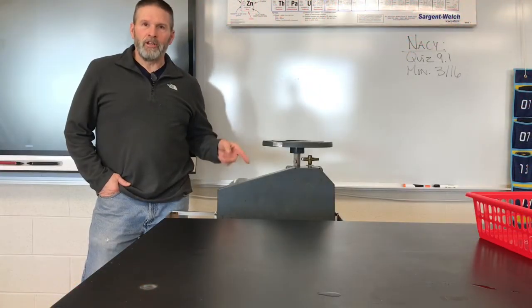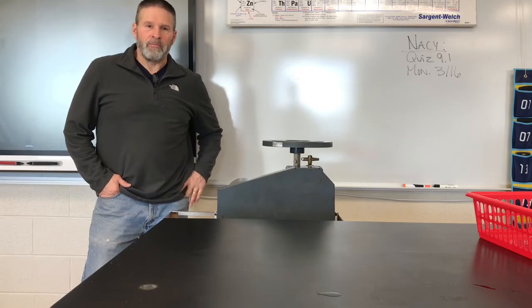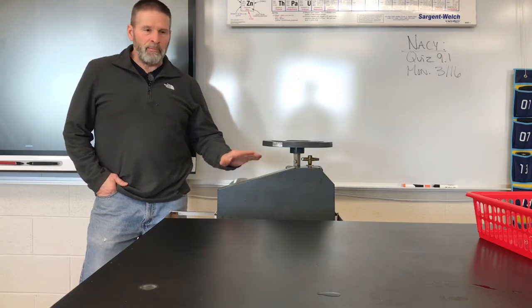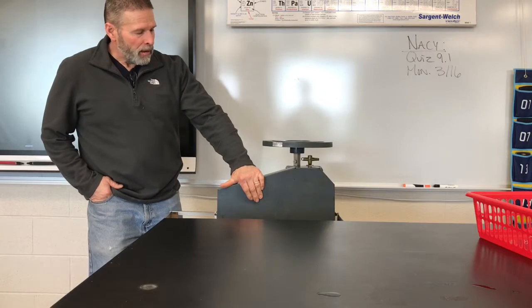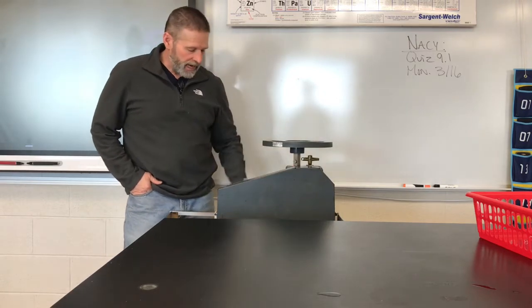All right Chem Nation, today we're taking a look at the vacuum pump and doing some demos with that. The vacuum pump has an electric motor. There's a belt in here that runs a pump, a diaphragm pump.